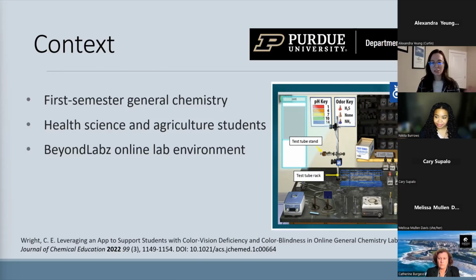It's kind of your generic bench top that's got a whole bunch of stuff on it, ring stand and a whole set of chemicals in a storeroom beyond that. And so students can work in this 2D lab environment to do some of the experiments that they might get to do in person labs and some other experiments that they wouldn't be able to do otherwise.